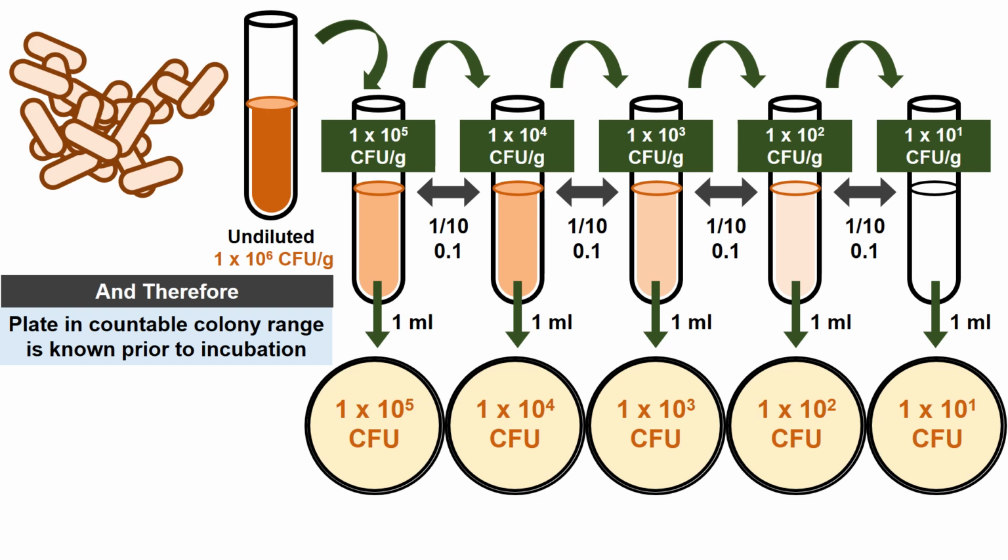This is also now out of the countable range. This one is too low. This porridge is not right. There's only 1 bowl of porridge in this. The rest are too hot or too cold. The one that you want, and watch out for those bears. They're crazy.